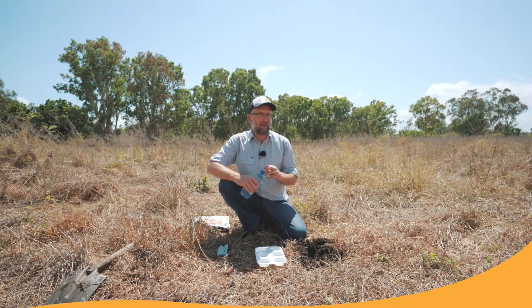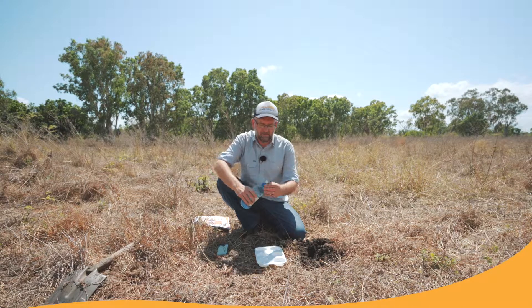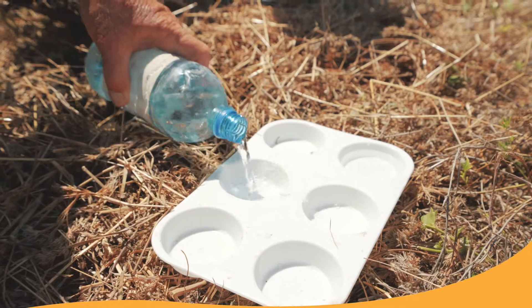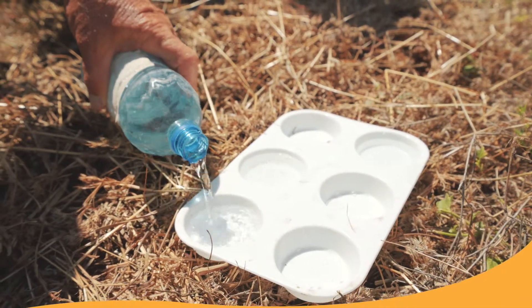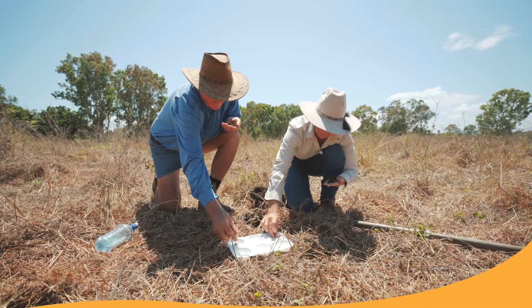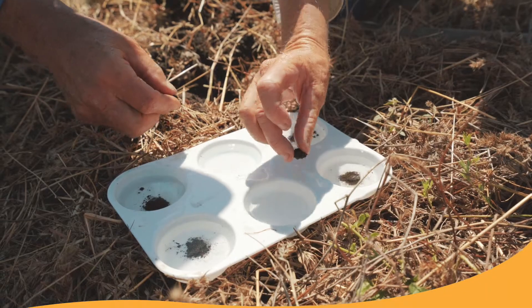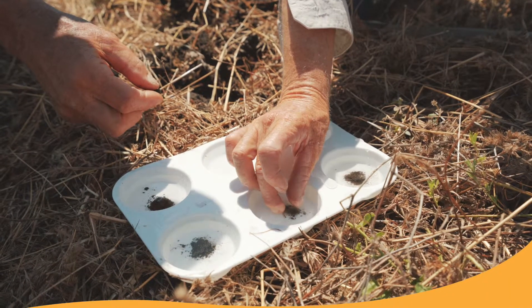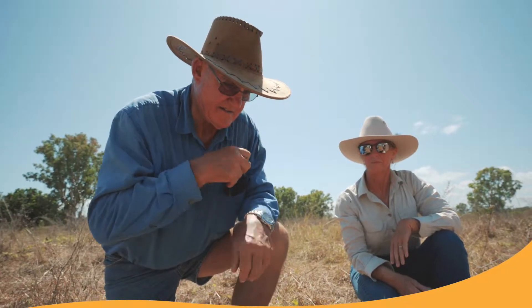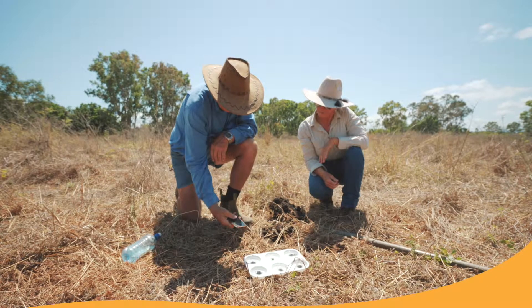The next step, once we have our aggregate at our monitoring point, is to get our water in our plastic dishes. We fill our plastic dishes with some of the distilled or rain water and put it out on a flat surface. After we've got our water in our dish ready to go, we get our aggregate and carefully place it into the water without dropping it. We've now set our stopwatch and we want to time this for ten minutes and observe the aggregate and what happens to it.